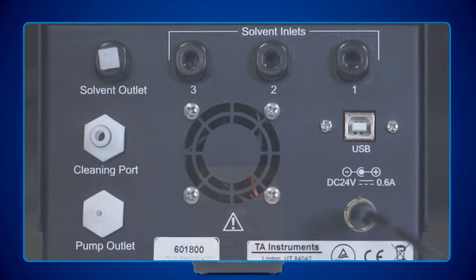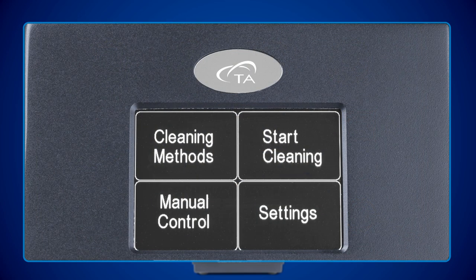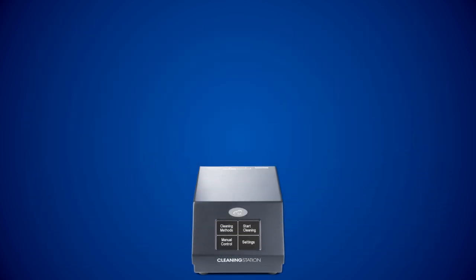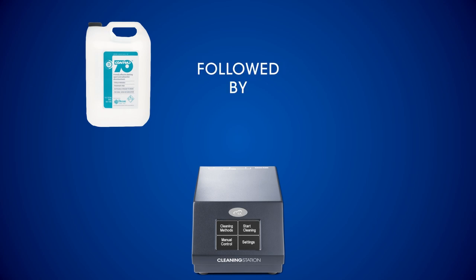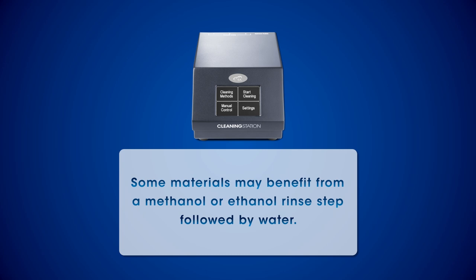This device has three cleaning ports on the back and an LCD screen on the front for execution of manual or programmed methods. Typical solutions used are 2% detergent such as CONTRAD or Micro90 followed by DI water. Some materials like membrane-bound proteins or micelles benefit from a methanol or ethanol rinse step followed by water.